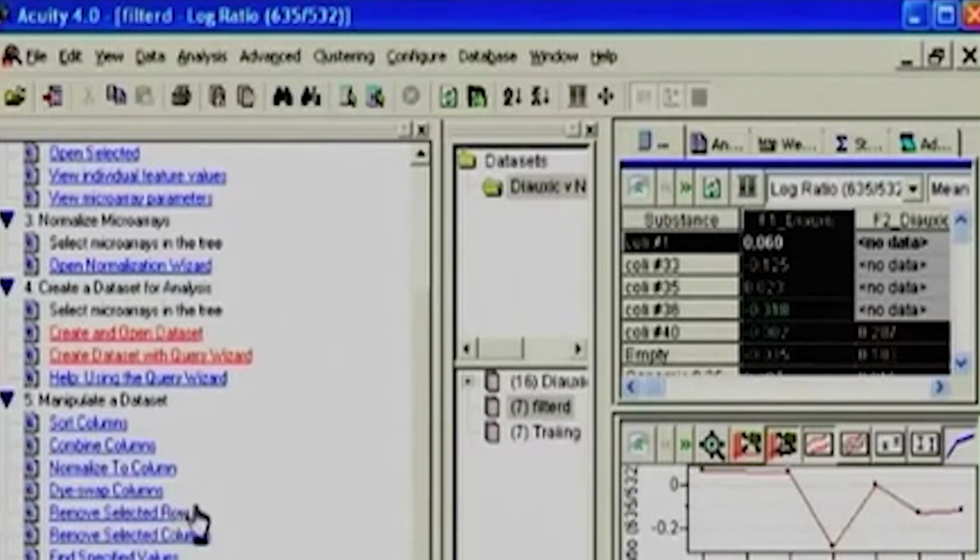We also talked about dye swap, and I was talking to them about dye technology and how one needs to use, in fact, labeling with different dyes and reverse dye swapping so that there is no dye bias in the analysis. True. So same can be accommodated here in the microarray to look at. That was a very nice part actually to go ahead with.